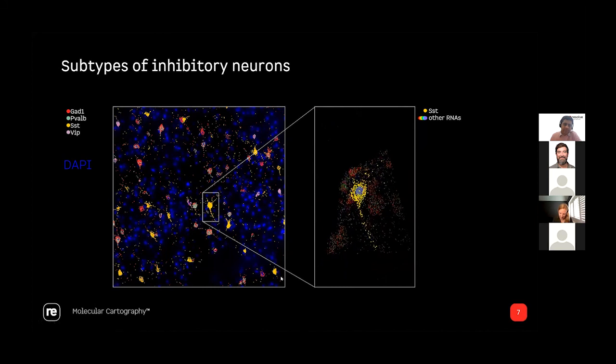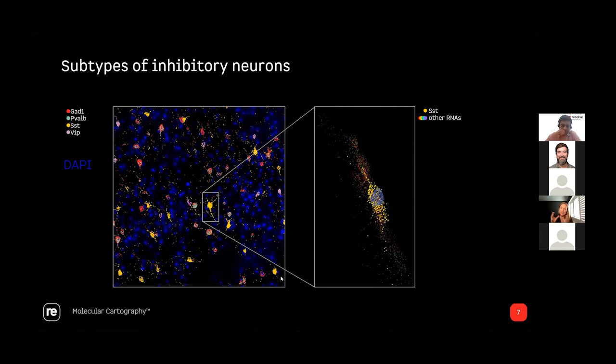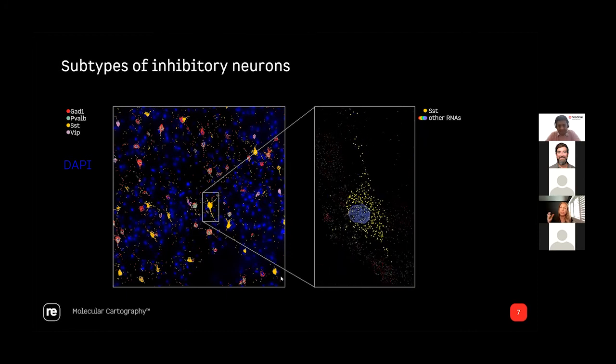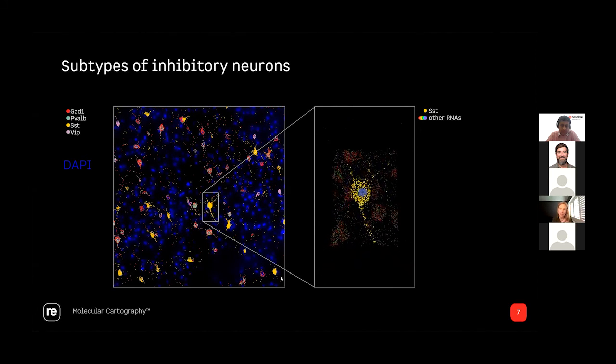Great. Okay. And the other quick question was that you showed that most of the changes occur within 20 microns of the plaque, which fits in with what others have shown about synapse loss around plaques, that kind of thing. My question was, you measured that from the center of the plaque, right? Not from the edge. Right.